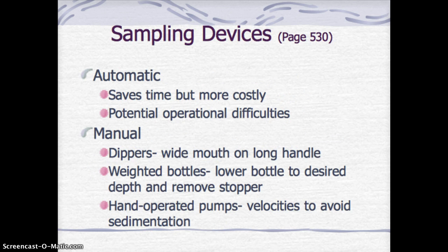Continuing on in that same section, you'll read more about automatic sampling devices. They do save time, but they are more costly. And of course, they would have potential operational difficulties, functions, mechanical or otherwise.